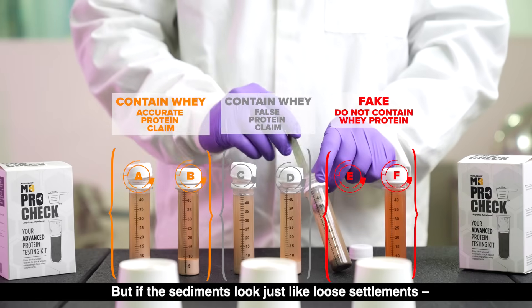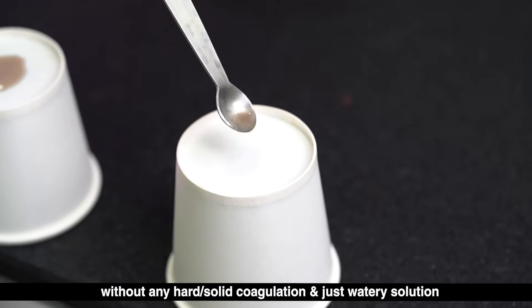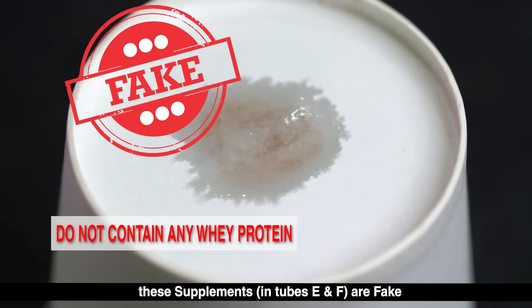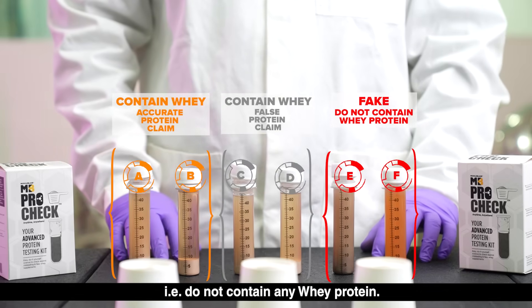But if the sediments look just like loose settlements without any hard or solid coagulation — just watery solution — these supplements in tubes E and F are fake, that is, they do not contain any whey protein.